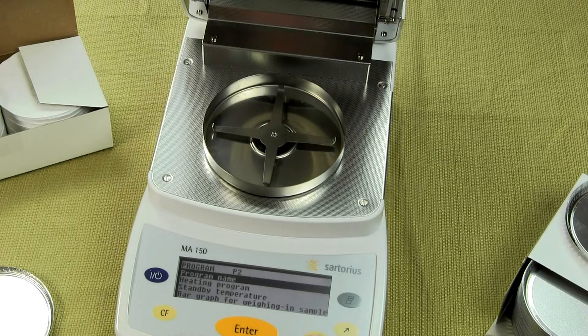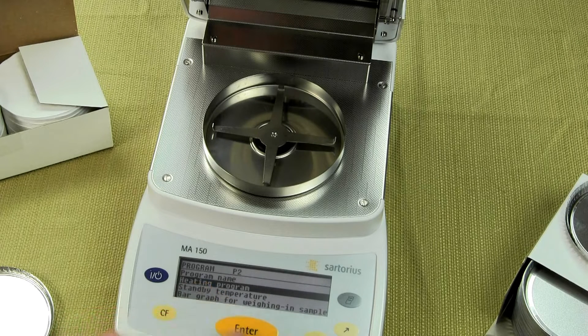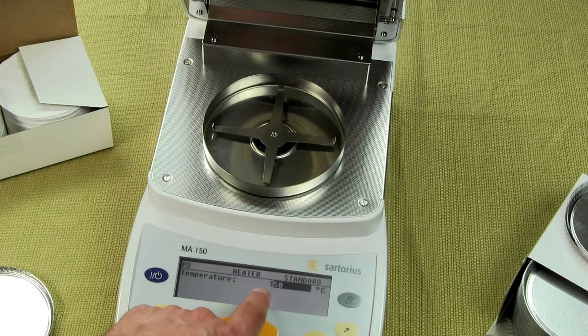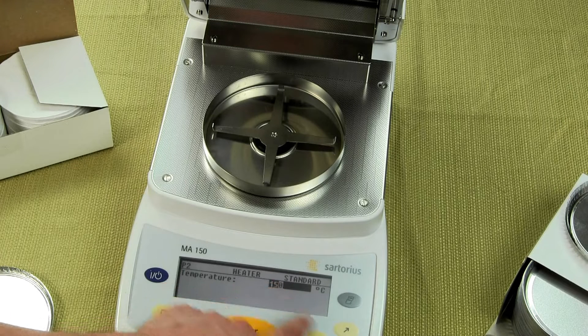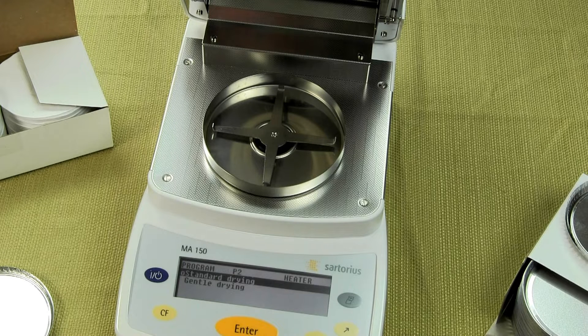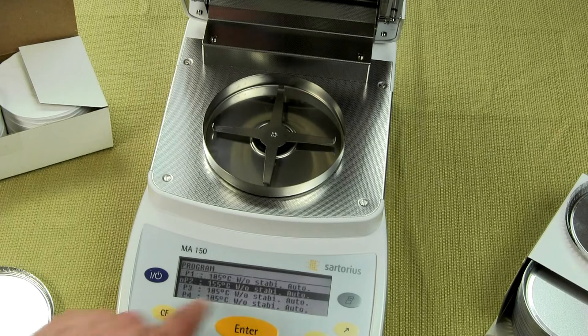You go into it and for the heating you select heating program, enter. Then we want standard drying and set the temperature. Right now we have the temperature at 150 — let's change this to 155. The 1 is highlighted, hit enter. The 5 is highlighted, hit enter. We have a zero here and we want to set this to 155, so we hit the up arrow. Now we have 155, we hit enter. We've now stored that parameter. Hit clear to get out, and you'll notice we have program 2 at 155.